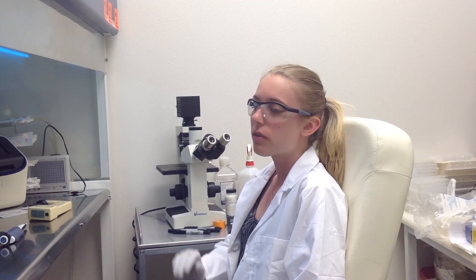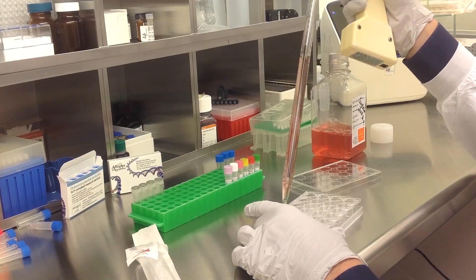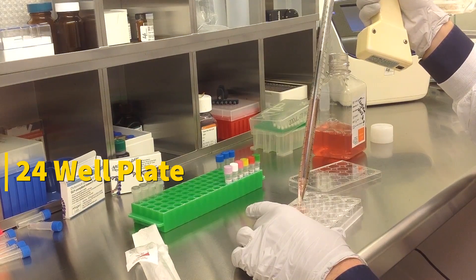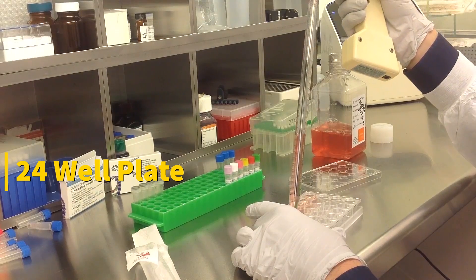Today we will be transfecting HT29 cells obtained from ATCC using a transfection kit manufactured by Altagen Biosystems. In this tutorial, we use a 24-well plate. Transfections can be scaled up or down based on plate surface area as described in the corresponding transfection protocol, which can be found at altagen.com.